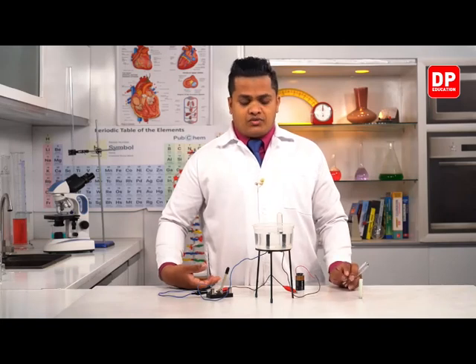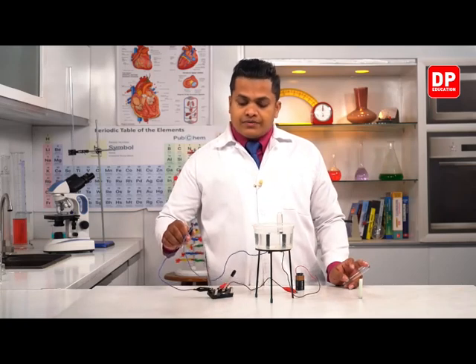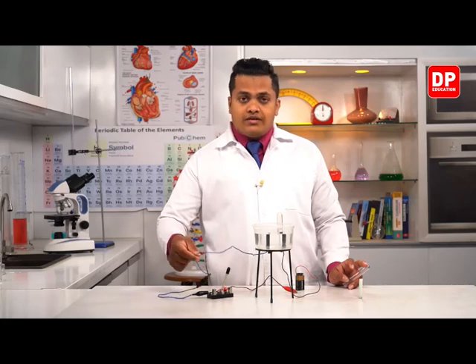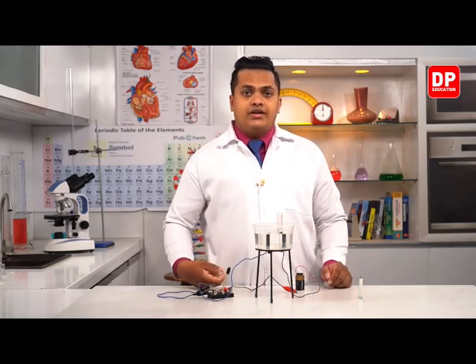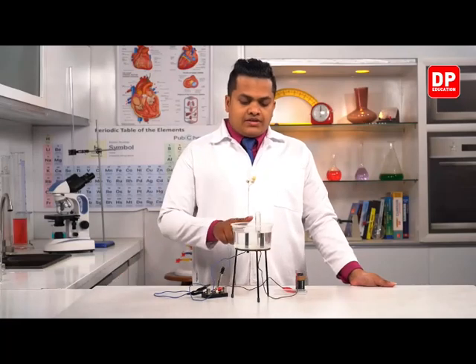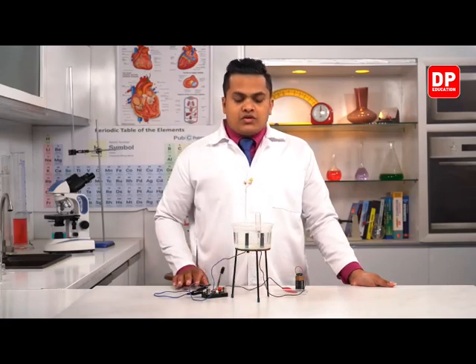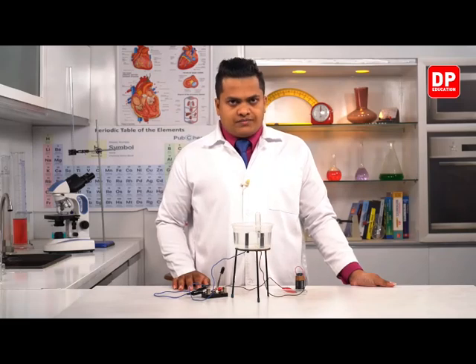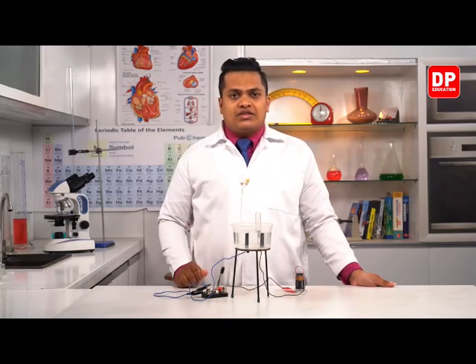So it's quite obvious to us that the negative terminal, the black colored negative terminal, the blue color wire, black color crocodile clip, this one, contained hydrogen gas. So my dear children, this is the container that is in the positive terminal. Within the positive terminal, the gas which is getting collected is oxygen. However, here now very little oxygen is there.